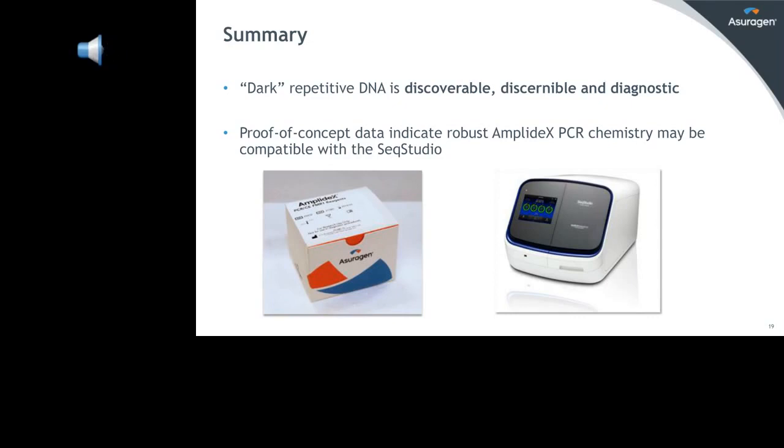We've done comparable studies against some of the other targets with the other genetic analyzers in the ABI-CE family, and have seen results that are very consistent with those types of findings. So we expect that being able to look at a few percent of cell equivalents based on the sensitivity of the instrument is achievable.